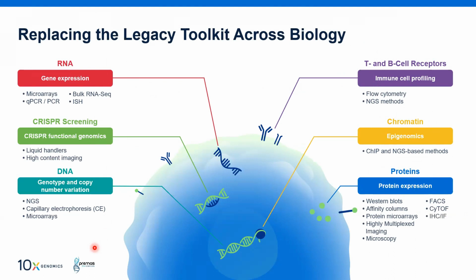Now, one workflow is a single cell technology, which can help you generate this diverse data using an NGS sequencer in a much simpler way, as compared to multiple platforms, multiple equipment you are using to generate different types of data from the sample. And it has also promised that you can generate 2 or 3 types of data, or 4 types of data from the same cell, which is practically impossible by any other technology right now.